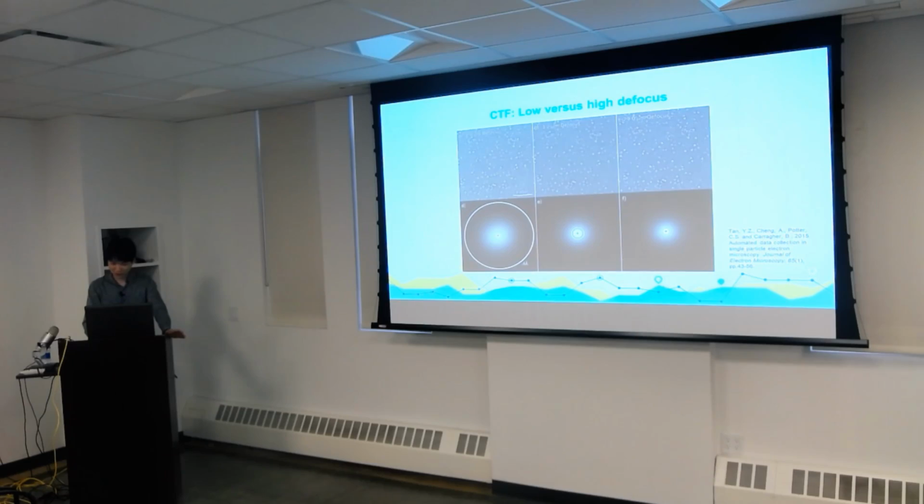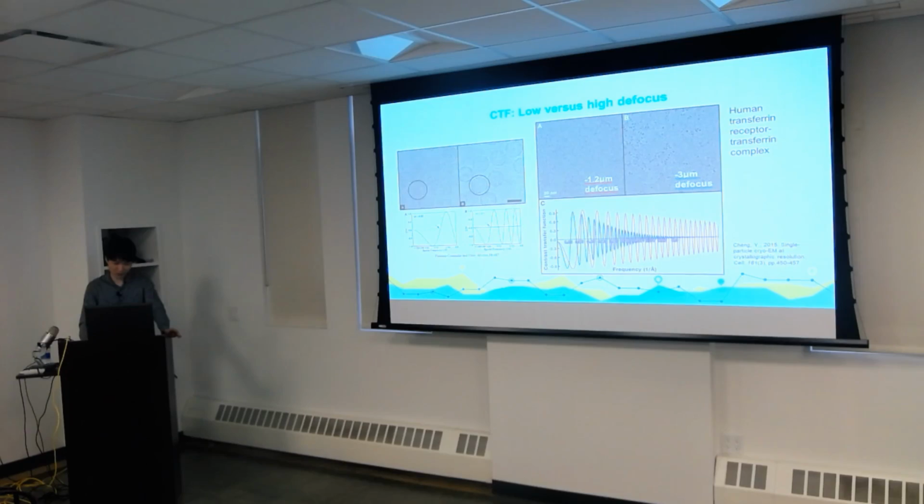high resolution imaging, you will actually, this is directly from Grant Jensen's slides, you don't really see these viruses anymore. They become really hard to see. And the reason why is that you don't get that many oscillations at the lower spatial frequencies, which can represent things like the edge of your virus, as well as the larger features that allow you to distinguish a virus from the surrounding water. With more oscillations, and then you go up, down, black and white, you can actually see these things more clearly.